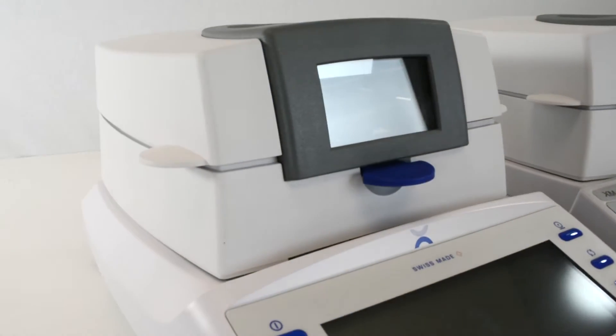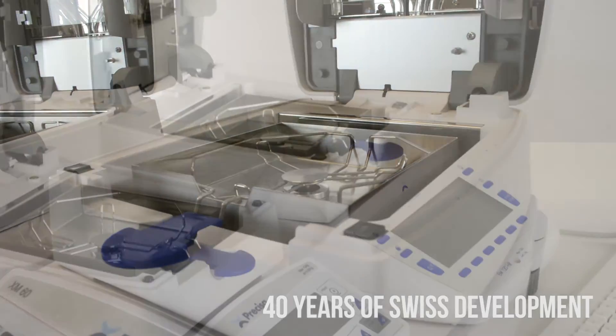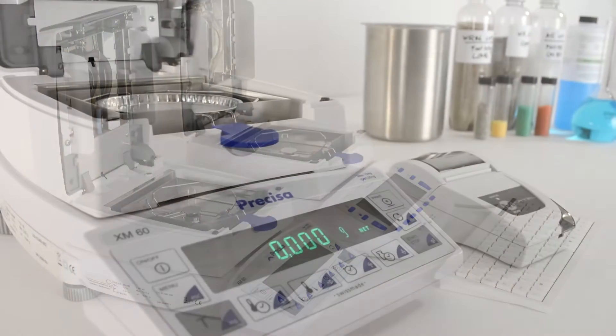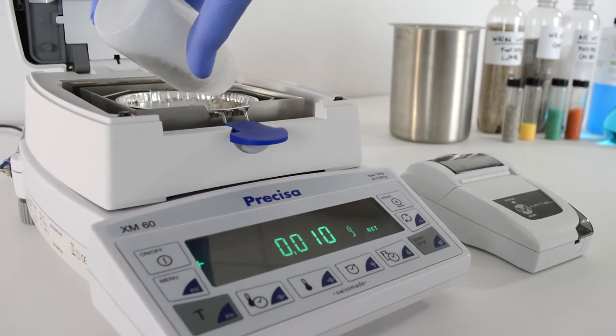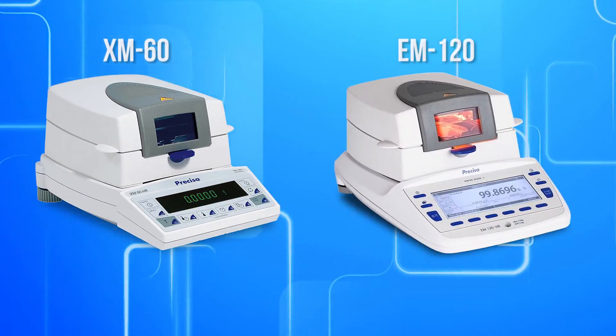The Precisa line of moisture balances is the culmination of 40 years of Swiss development and manufacturing excellence in thermogravimetric instrumentation, exceeding user expectation in these three most important categories. Precisa offers two moisture balance series: the XM60 and the EM120.